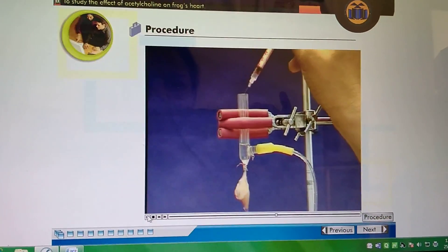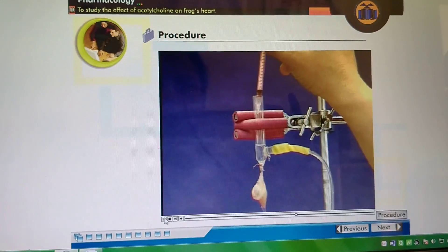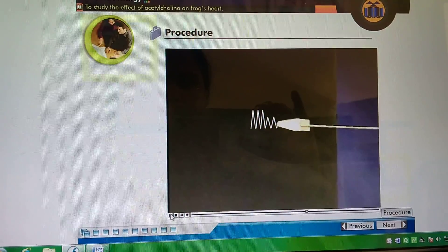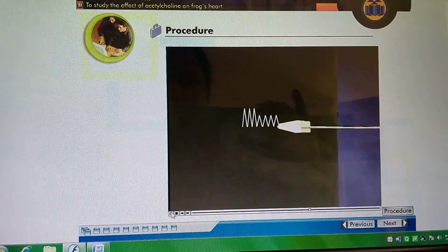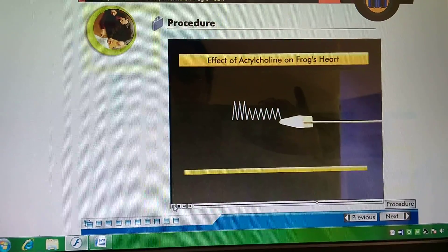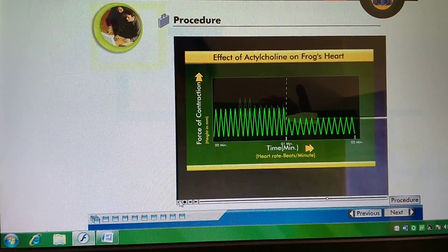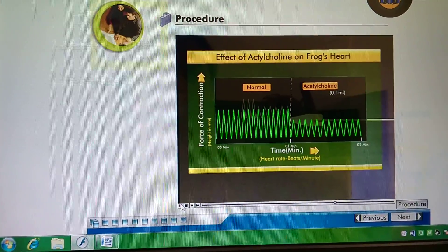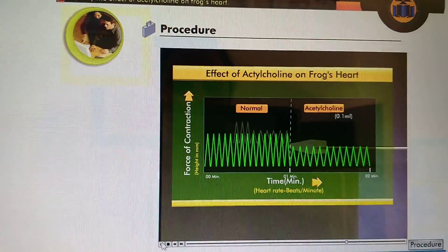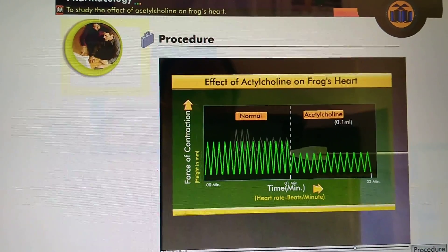Now stop the drum and inject 0.1 ml of acetylcholine solution into the cannula. Start the drum immediately and record the response of the heart on the smoked paper for one minute again. You can see that the rate of contraction and force of contraction of the heart reduces due to acetylcholine. Also observe the rhythmicity and tone of contraction.